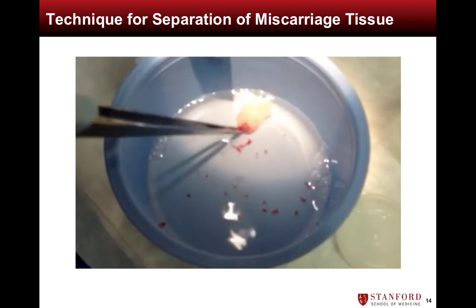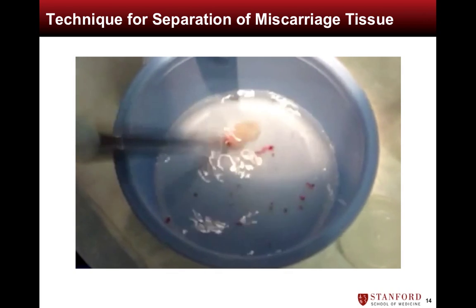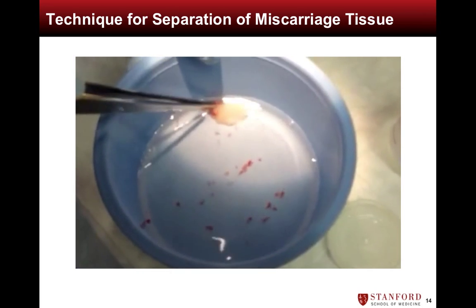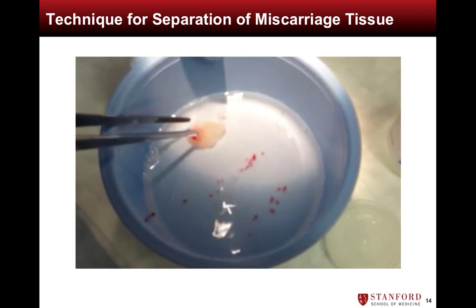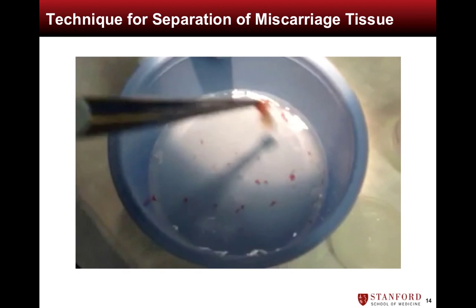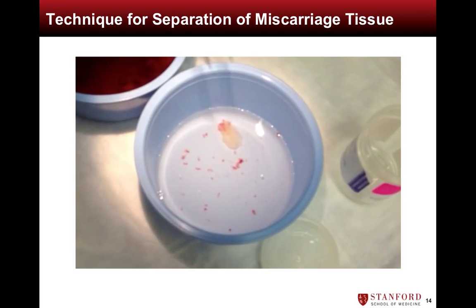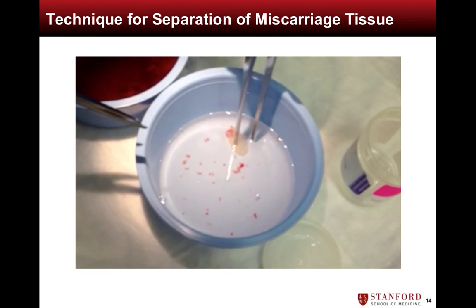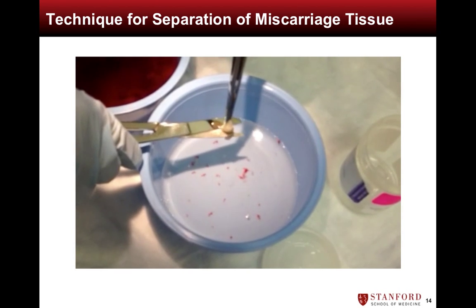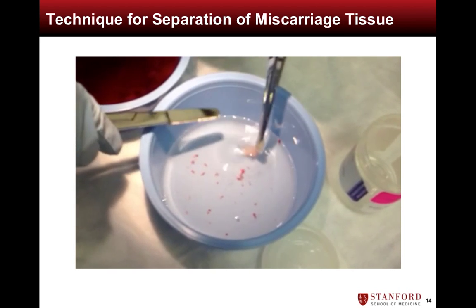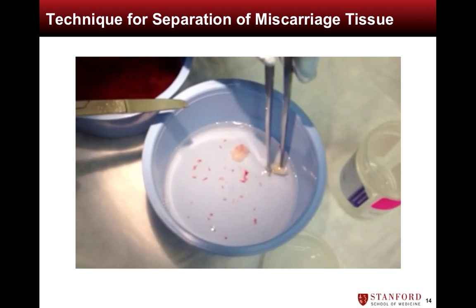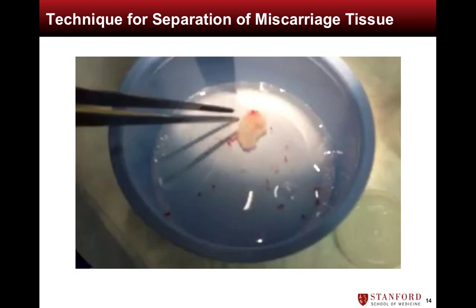Maternal decidua, which can be visually identified as pinkish-red in color, can be separated from the chorionic villi by grasping the tissue with smooth pickups and agitating the specimen, as shown in this video. If this is unsuccessful, the tissue containing both decidua and villi should be incised completely from the specimen, leaving only chorionic villi for chromosome analysis.